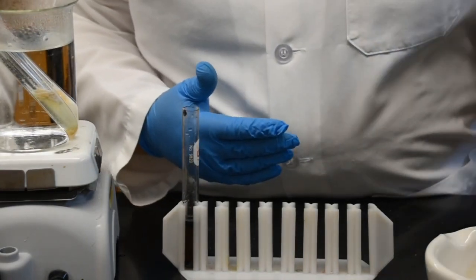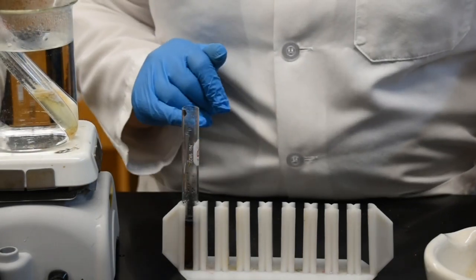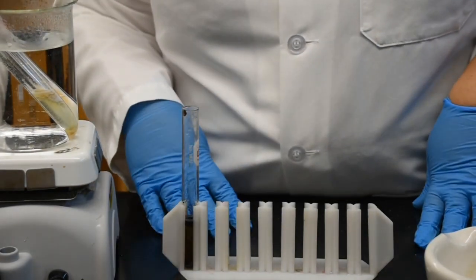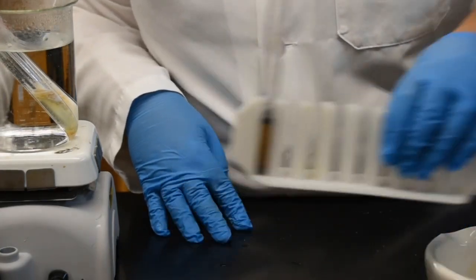So what I'm gonna do is I'm gonna do my samples, heat them up if they need to be heated, and I'll come back with the final result for your data, okay?